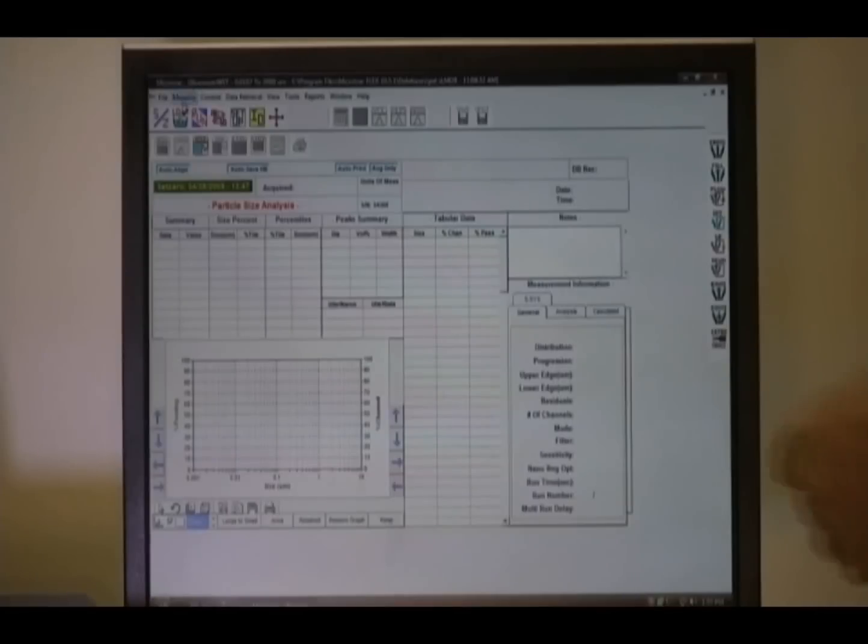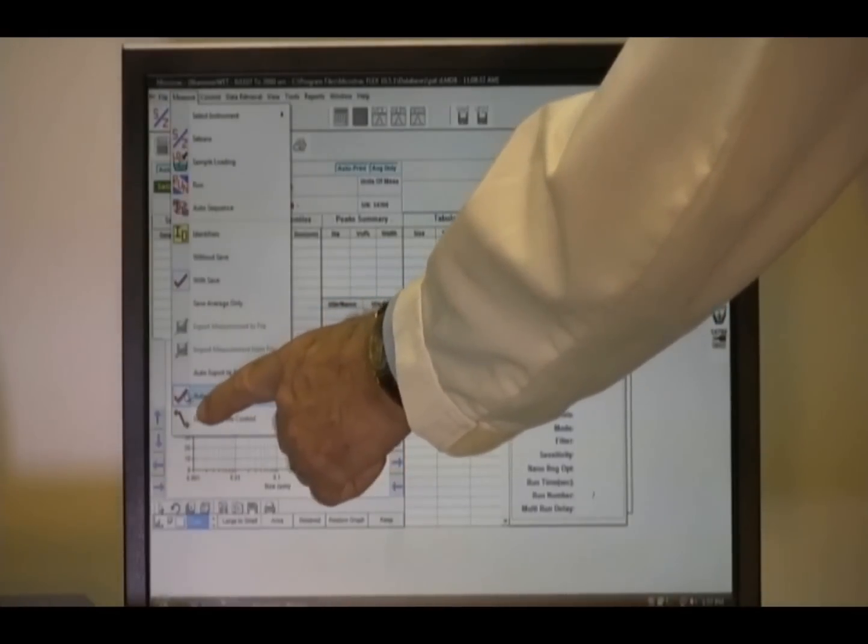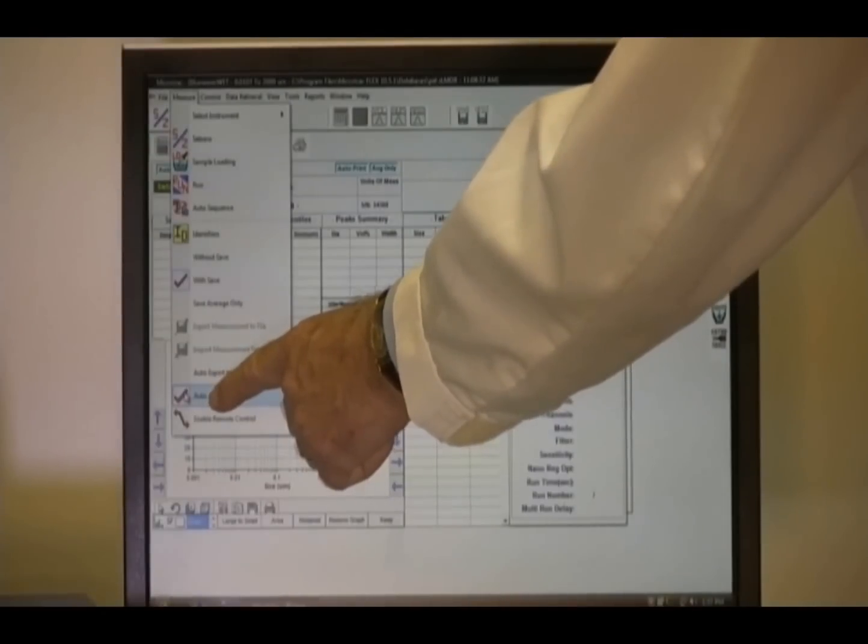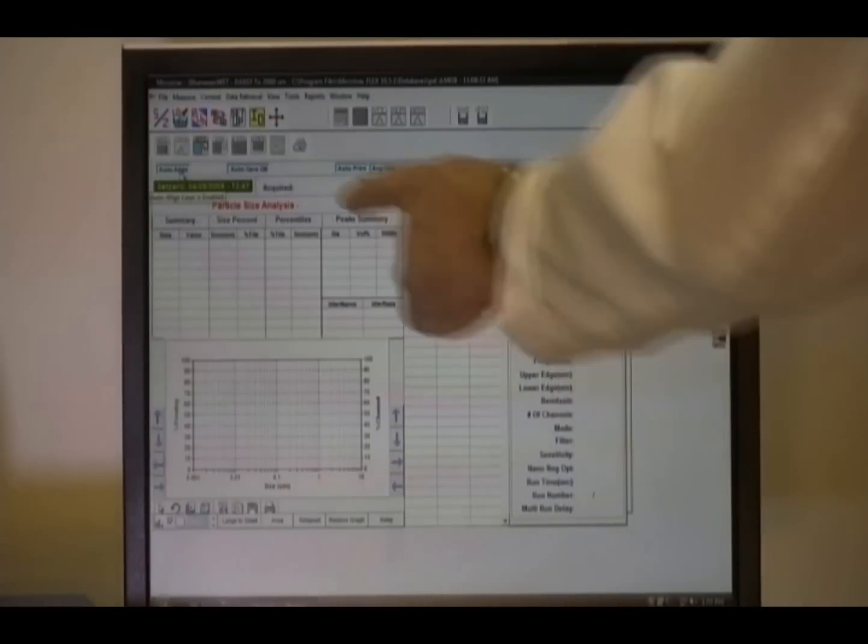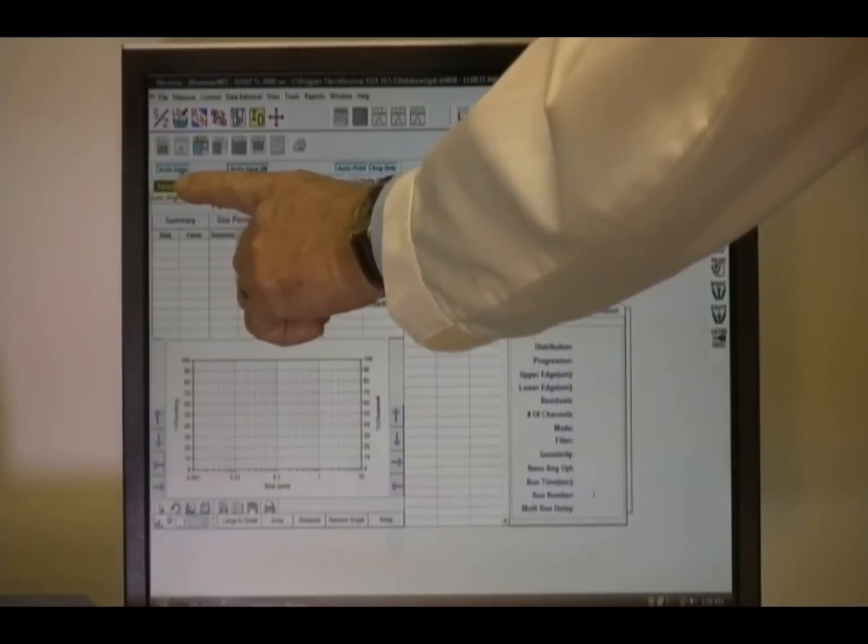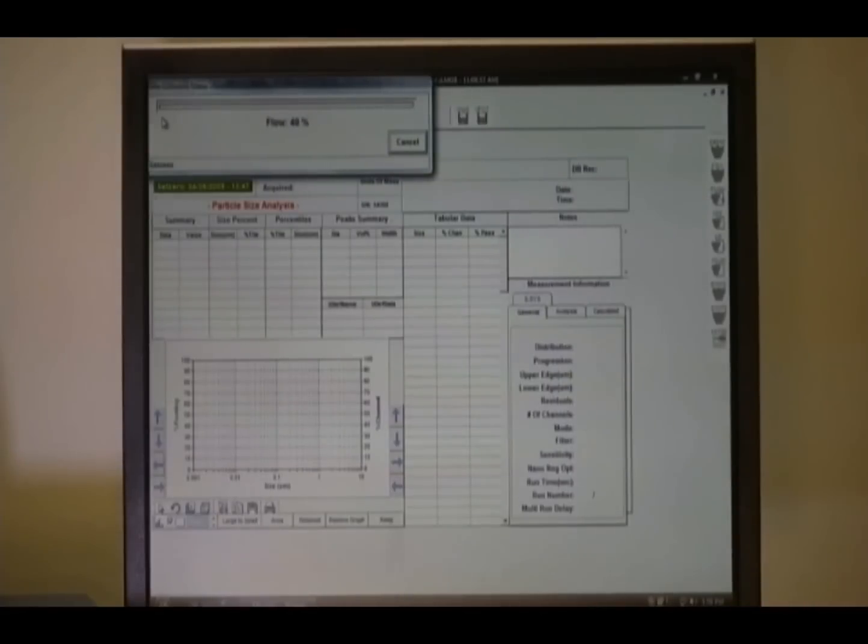First thing to do is go to the measure tool, come down to auto-align. You'll notice that the auto-align has a check next to it. This means that during any set zero, the instrument will automatically align itself. The next thing to do is to start the auto-alignment. You'll notice that there's a blue bar that states auto-align. This means that auto-align is activated. I will come up to the toolbar for set zero and click on the set zero icon. The very first thing that will happen is that an alignment will occur. The next thing that happens is that there's a measurement initialization in progress. This is the start of the set zero measurement. For this video, I've set the set zero time for 10 seconds. The normal set zero time for blue wave and S3500 is 30 seconds.